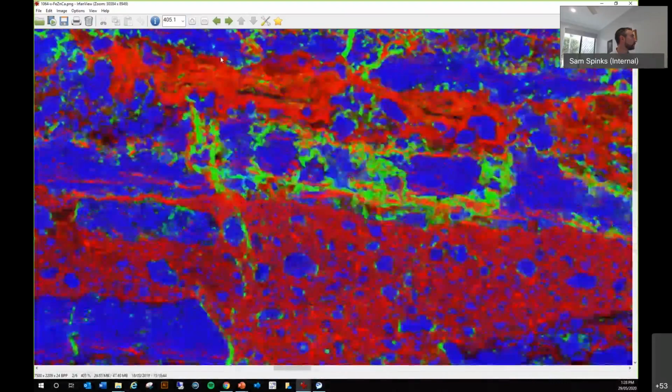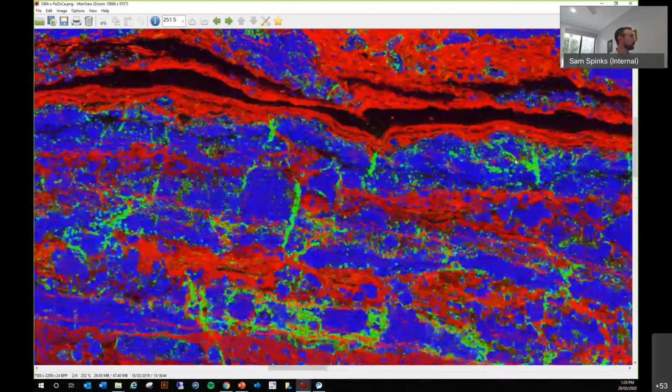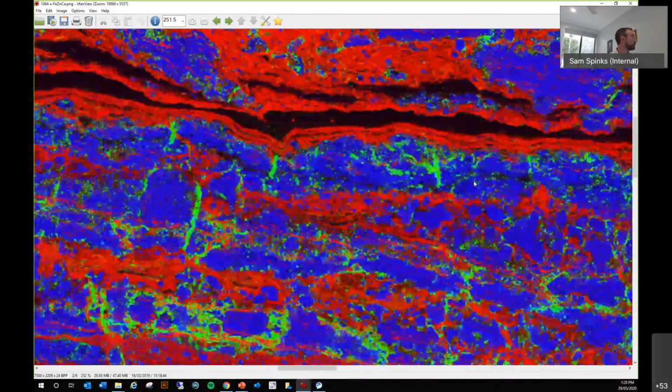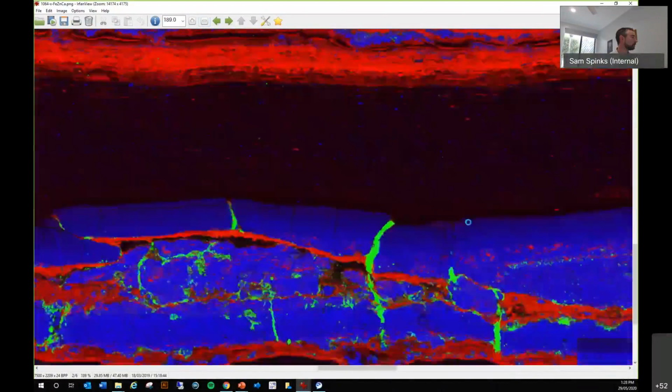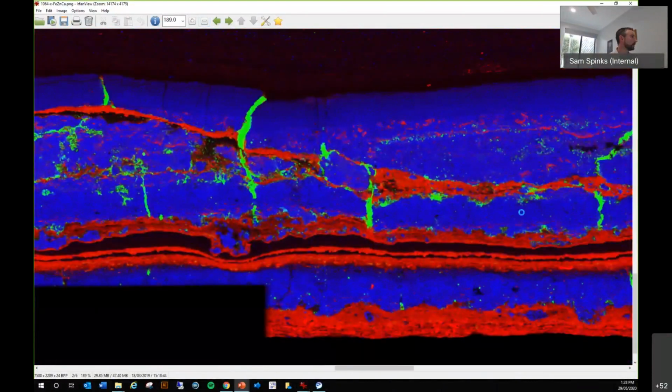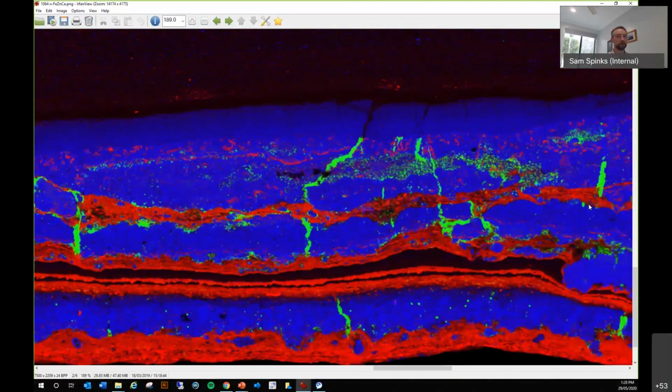If we look more closely at some of these, you can see that throughout these bedded carbonates, the sphalerite occurs always within the solution margins of those. But what I want to draw your attention to in these subvertical fractures is that in some places the fractures cross-cut the carbonate, but they don't transect the pyrite laminae. So that suggests that the carbonate is being rigid during the deformation, but the carbonaceous and pyritic siltstone has remained quite plastic.